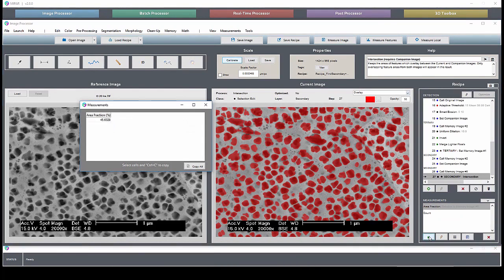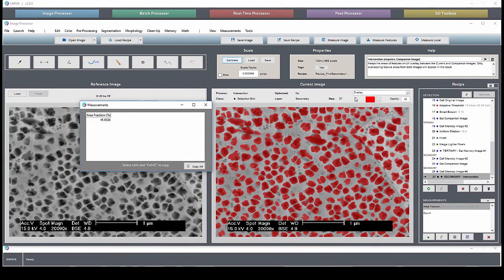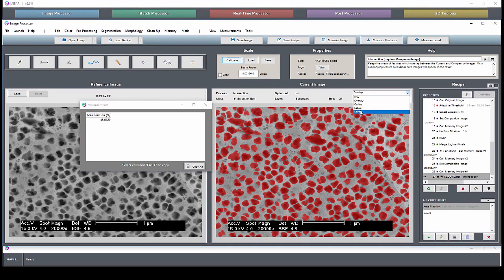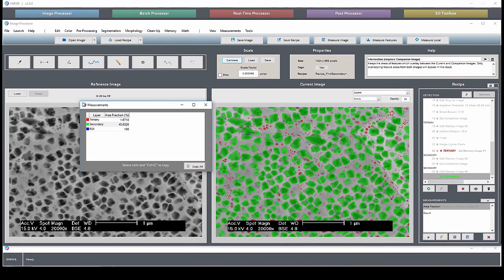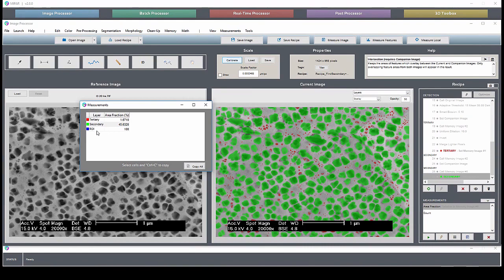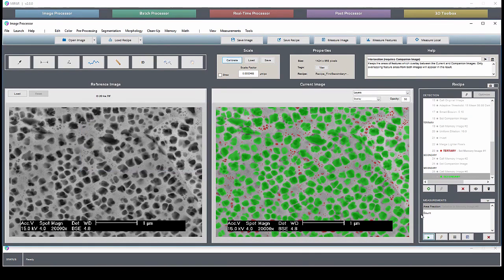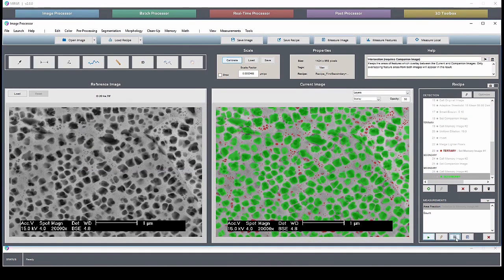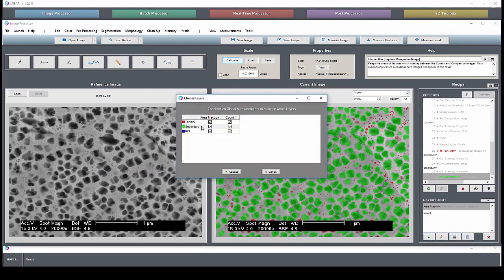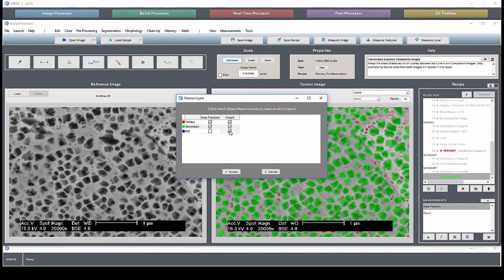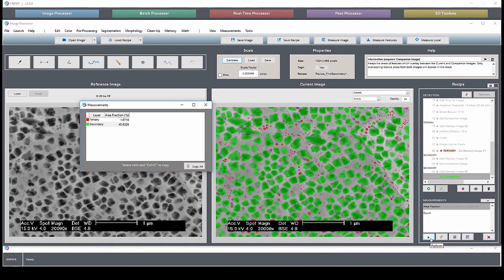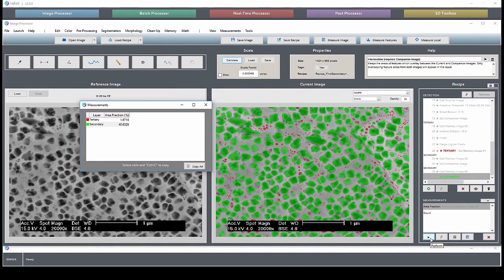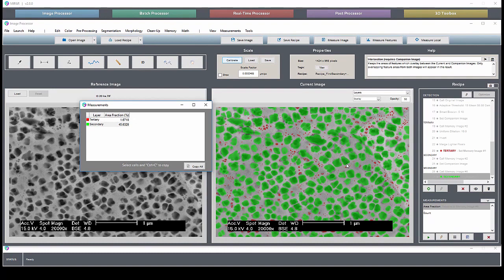For example, we don't want to have the area fraction of the ROI, of course 100%. That can be removed as well. And now we just find the area fraction of tertiary and secondary particles in this image relative to the region of interest.